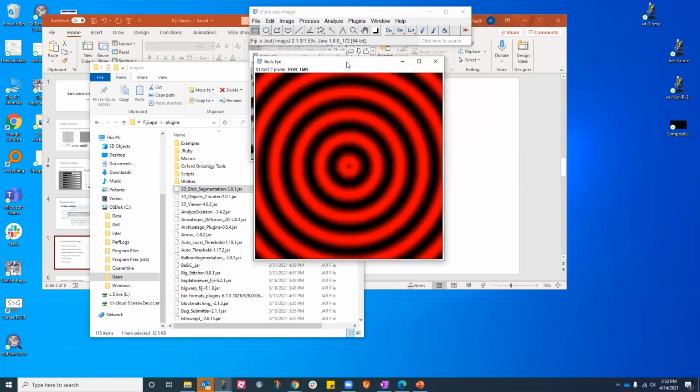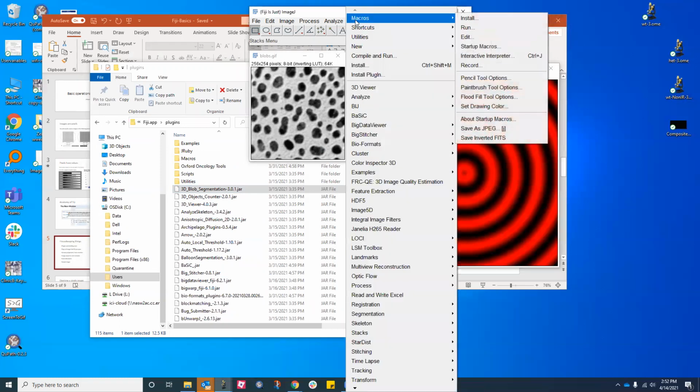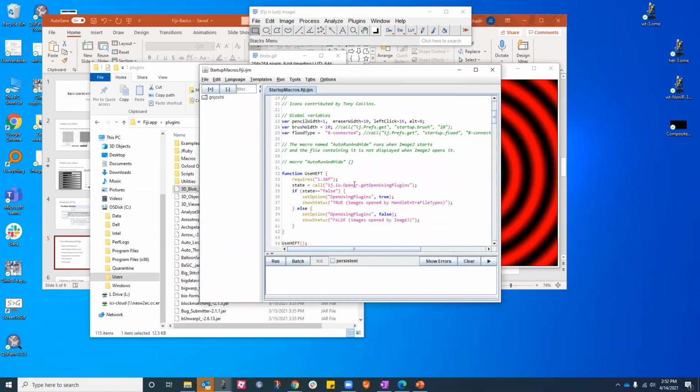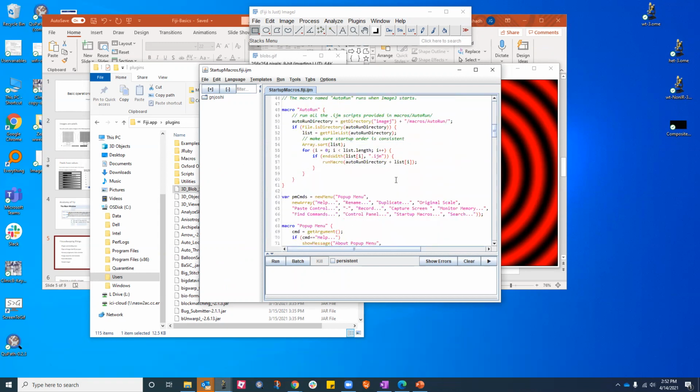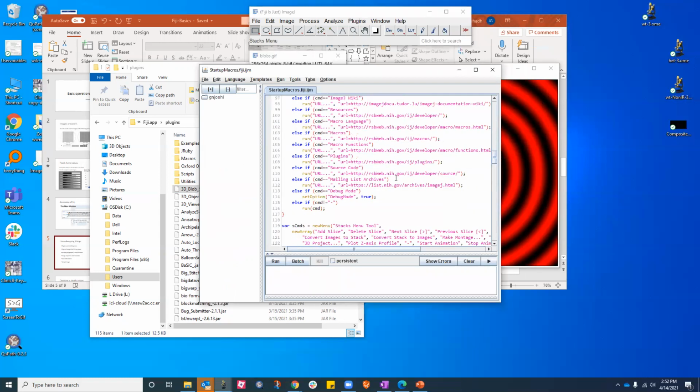All right, so this one just ran the macro. It did not open up. Startup macros. All right. So for example, it's nothing else but a little bit of code over here. Okay, that is executing for you. That's what I wanted to essentially talk about.